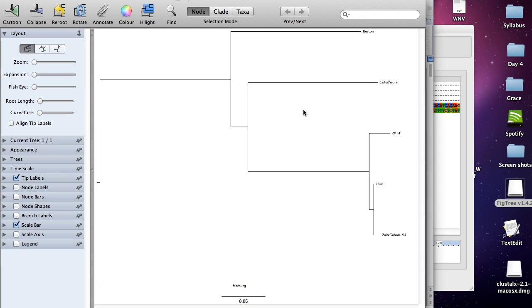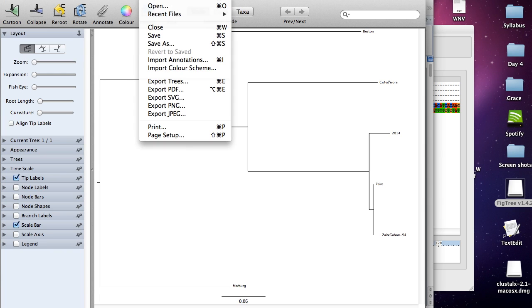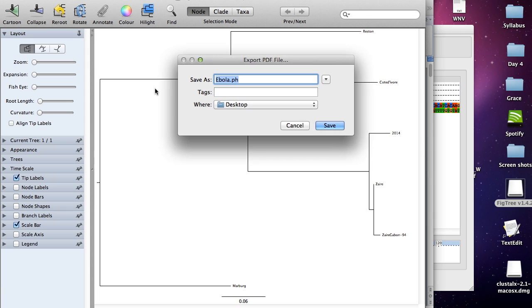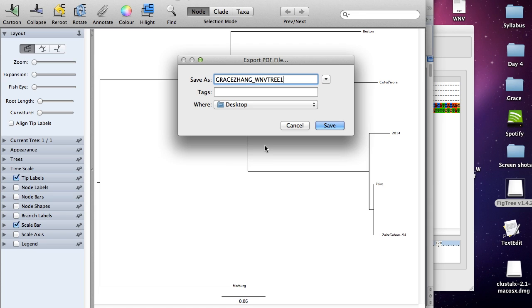Now we're pretty much done with this part of the assignment. All you have to do is click file, export PDF, and then you're going to save it as your name and then West Nile virus tree one. You're going to have another tree where you're going to add on another organism. In order to do that, you're going to have to go back to your text file and do these steps over again with the new virus.